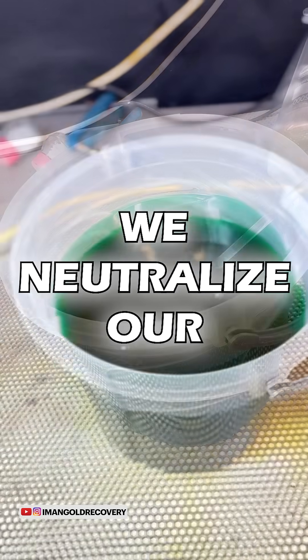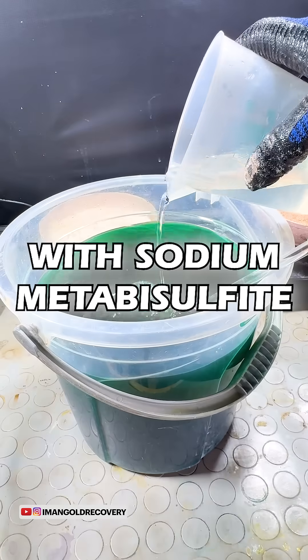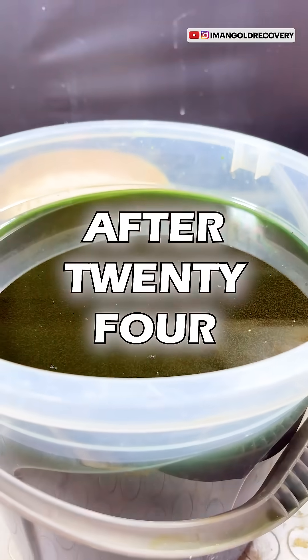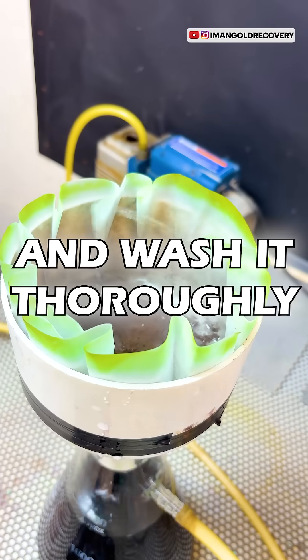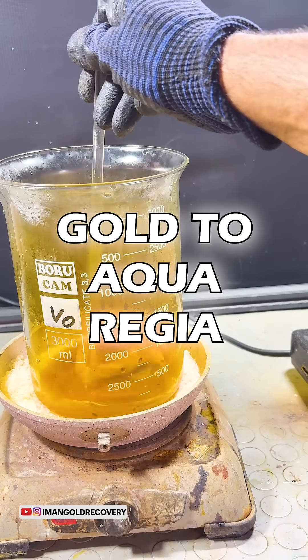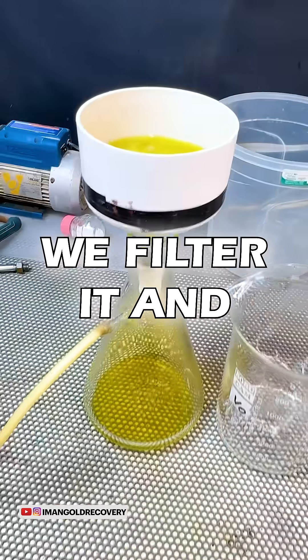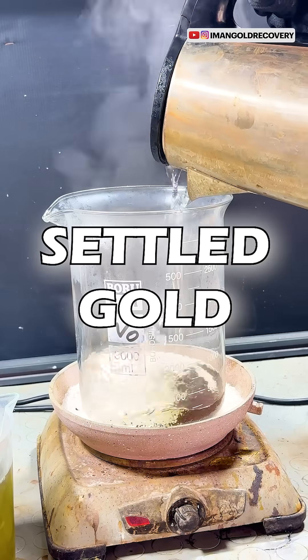We neutralize our Aqua Regia using urea and then precipitate it with sodium metabisulfite. After 24 hours, we filter the precipitated gold powder and wash it thoroughly. We subject our filter paper containing gold to Aqua Regia treatment again, filter it, and precipitate it again. After heating for one hour, we wash the settled gold.